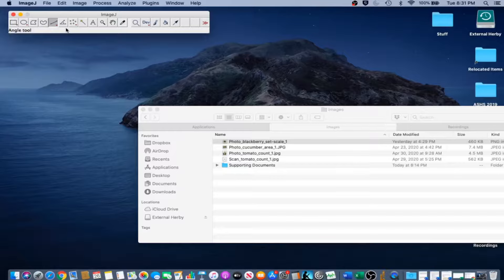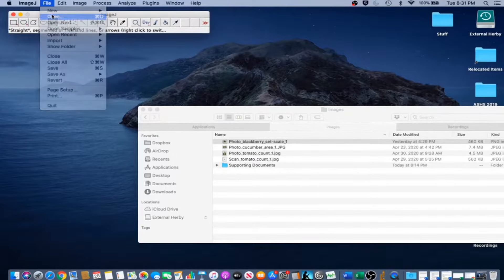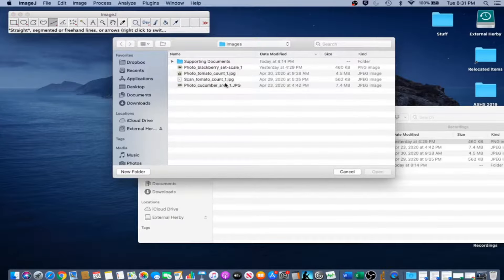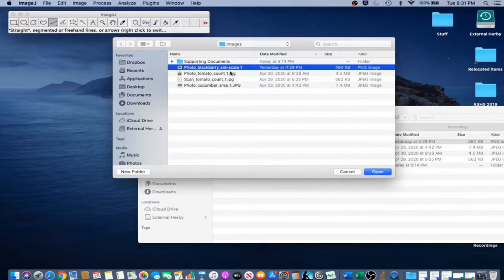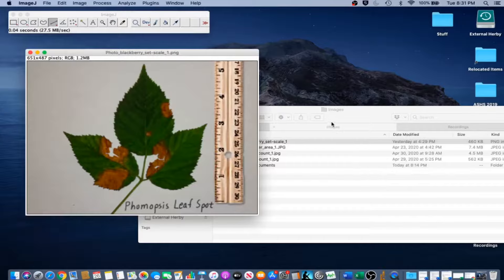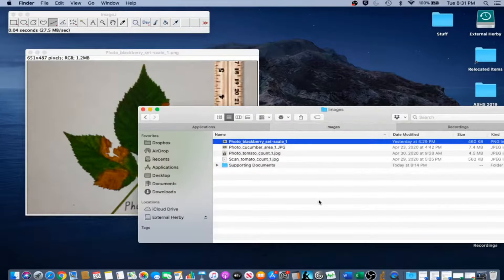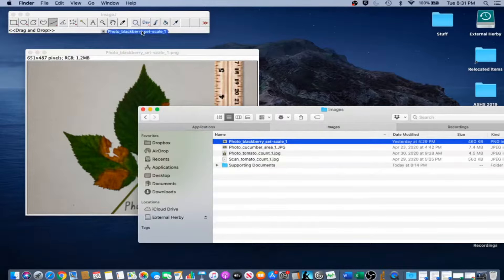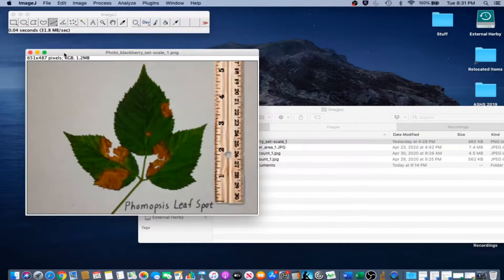In order to set scale for a photograph, first open the file. Go to File, Open, and navigate to where the file is located. Select the image and click Open. On many computers, you can also drag the image onto ImageJ's graphical user interface and the file will open. Our first example for setting scale in this case is a photograph.